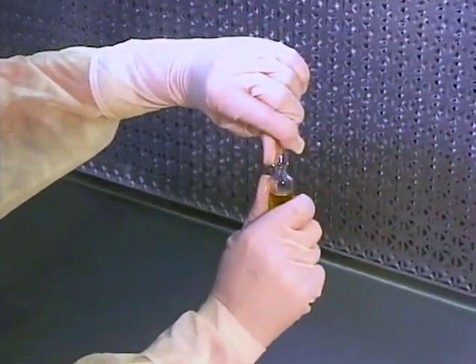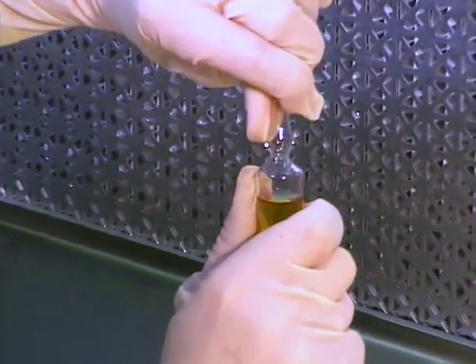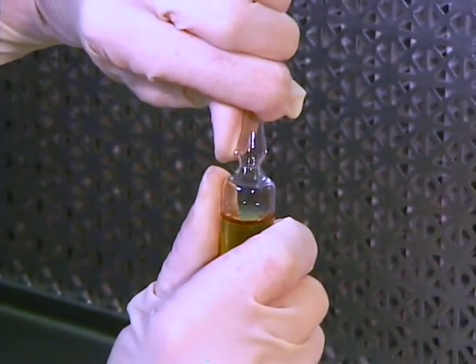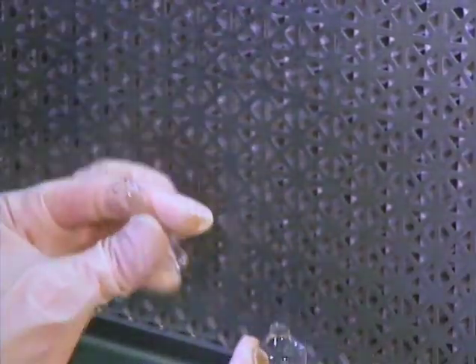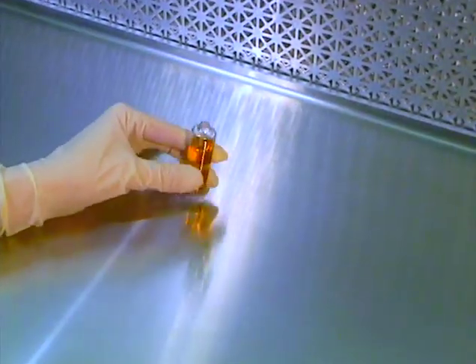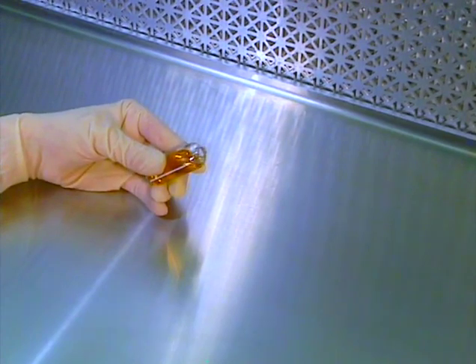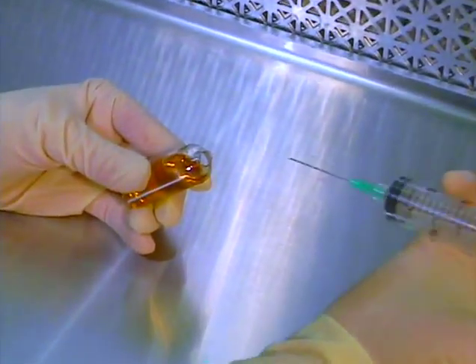Point the ampule toward the side of the hood so that no fragments of glass will fly into the HEPA filter or at the operator. While pulling upward and back on the top, slowly increase the pressure applied by the thumbs until the ampule just pops open. Place the ampule on the work surface, holding the base with one hand. Draw up the contents immediately to minimize exposure to airborne contaminants.